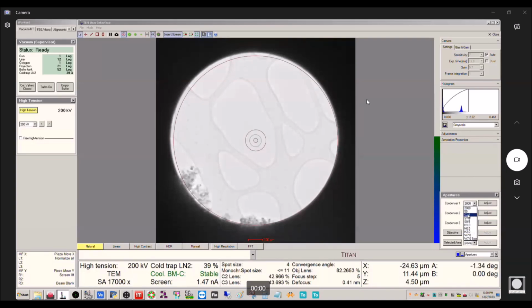But you can see here, this is what we have. The S's correspond to slits. This is 2 microns, 1 micron, half a micron, and then the H's, I believe, are holes, so these are circular apertures. And I believe the W's correspond to wedge shaped. So there's a lot of flexibility here with how you set this up. When we're not filtering the electrons, we always leave this at the 2000, because there's no point. These come in when we actually want to use the filtering.